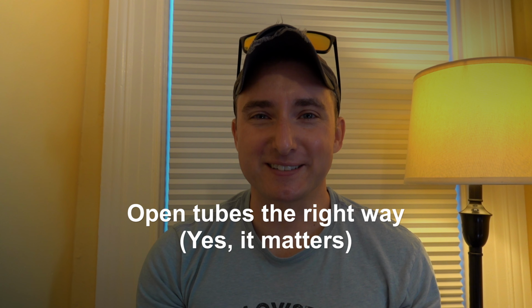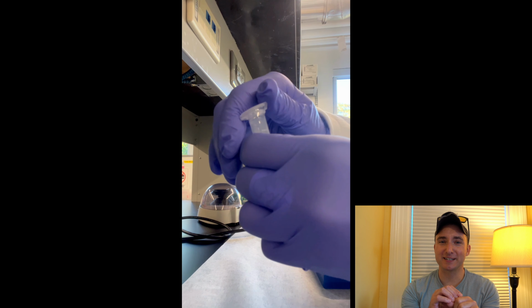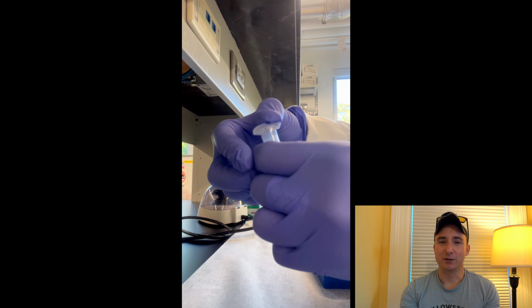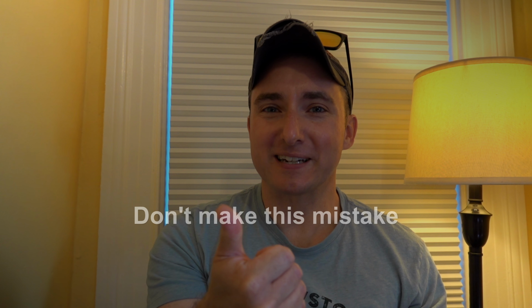Okay, so the first most critical step is almost so simple that some of you are going to wonder why I'm even talking about it. It's literally just how we open and close tubes. We are constantly opening and closing tubes, and there's a right way to do it, and there's a way that can really ruin your program. The right way is to go very gradually, slowly, with good grip on the lid, and just lift it off of the tube.